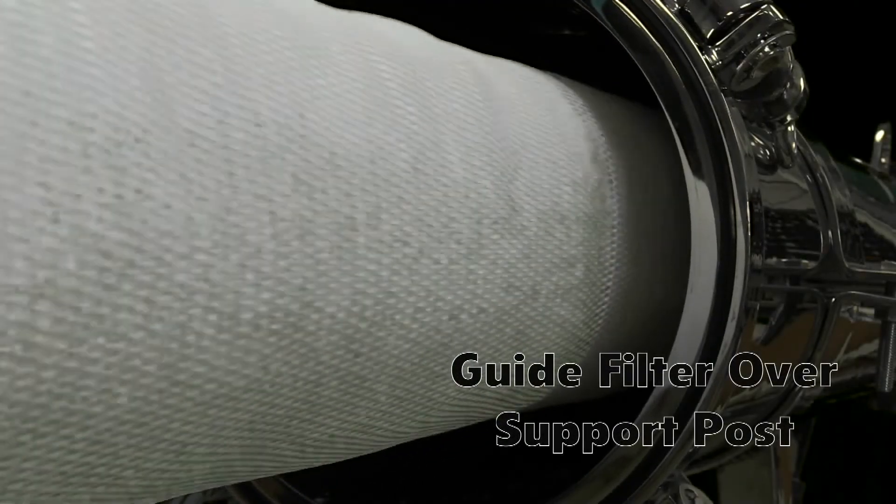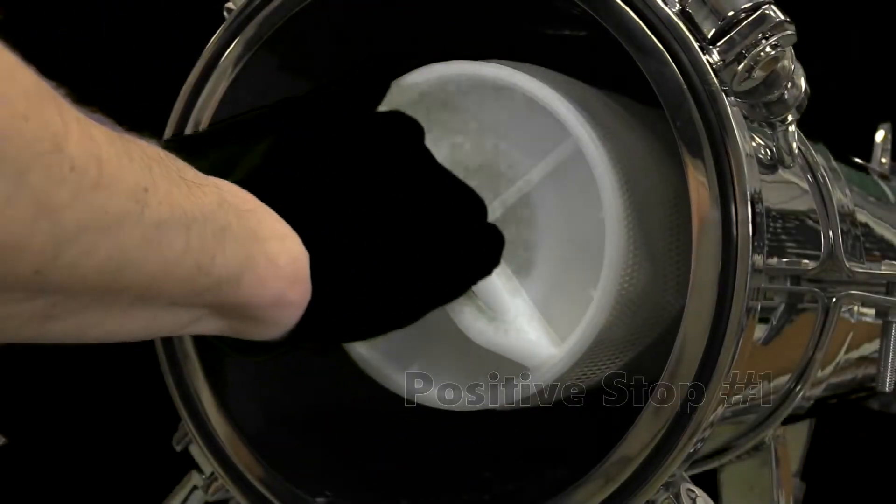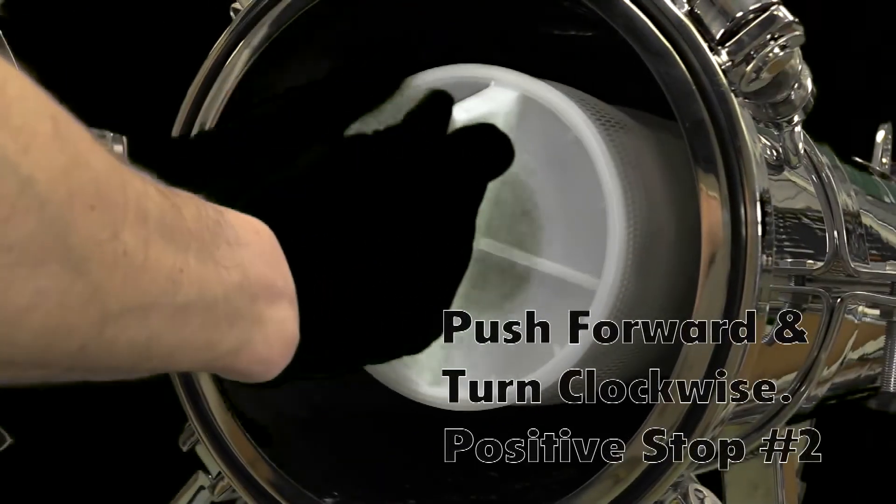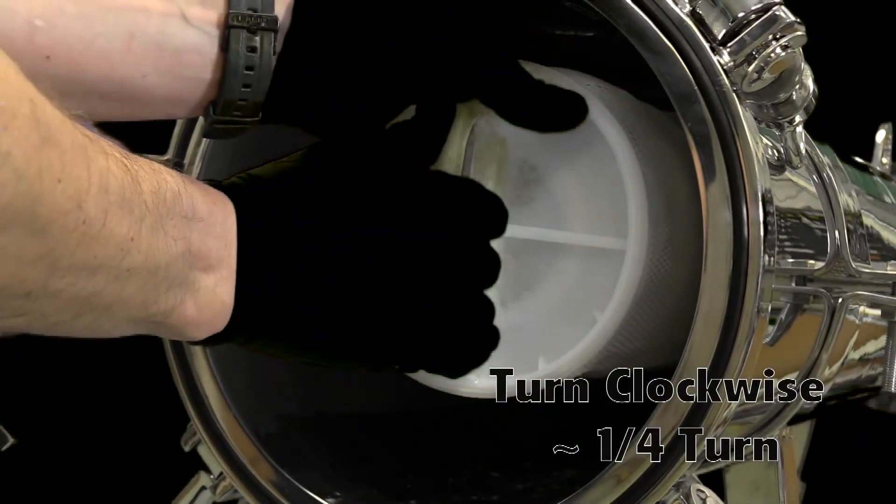Guide filter over support post. Positive stop number one. Push forward and turn clockwise. Positive stop number two. Turn clockwise one quarter turn.